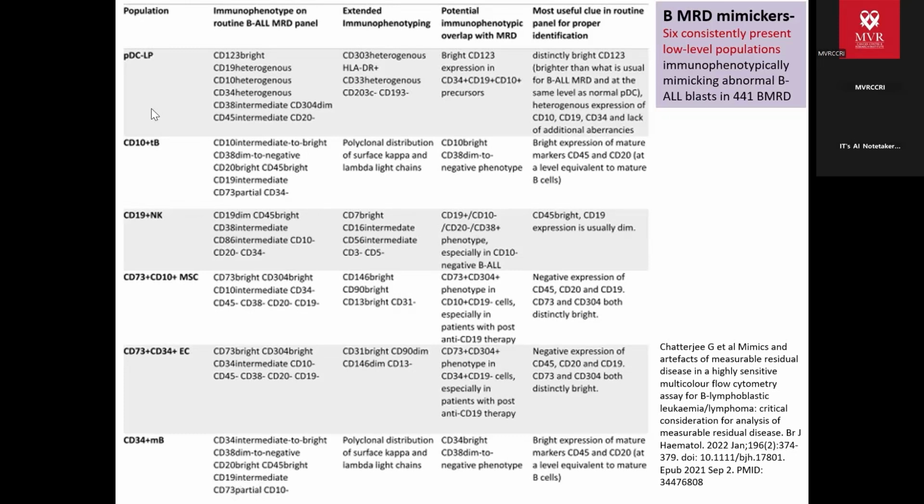You can send the sample again once the count has recovered if you have a clinical doubt. The higher the number of events, the higher the detection rate of lower MRD. In our lab, as I told, we aim to acquire 40 lakh events, 4 million. This is a plot which will explain why the events are very important. All of these are analyses of the same case, same sample, same time.